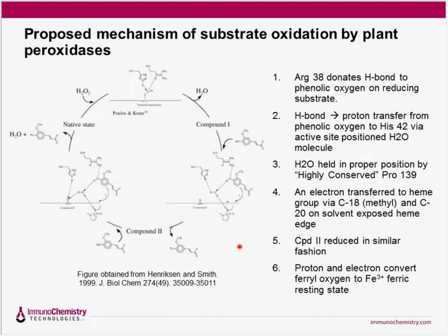So on the reduction side of the equation, HRP needs to get reduced back to its native state. In order to do that, it must oxidize a molecule of compatible substrate. For this particular experiment where they did this, instead of using a large substrate molecule, they used a small substrate molecule like ferulic acid. Ferulic acid has a phenolic ring structure, and that allows it to act as an electron donor.